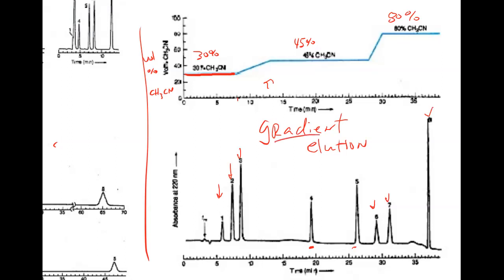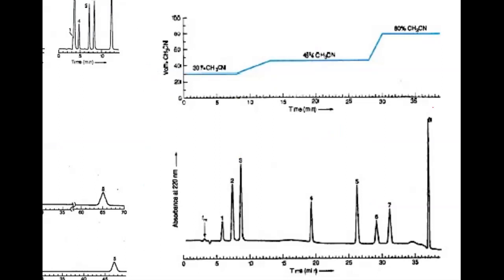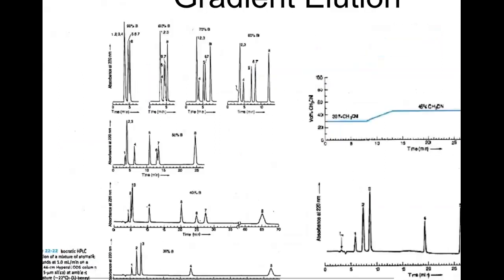So I ran a gradient elution. I changed the composition of the mobile phase through a run. Now let's summarize what the net result of that was, okay? Let me erase all this because there's kind of a lot going on, right? Over here on the left, this basically was isocratic elution.